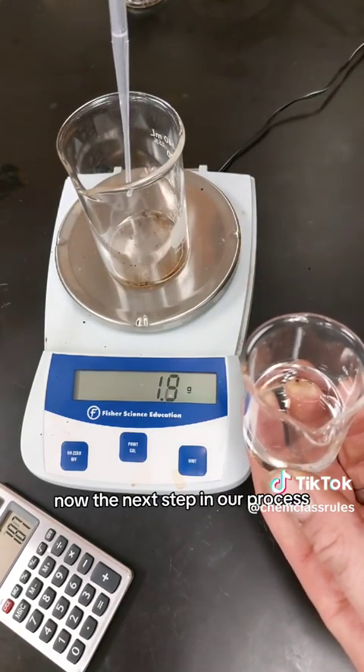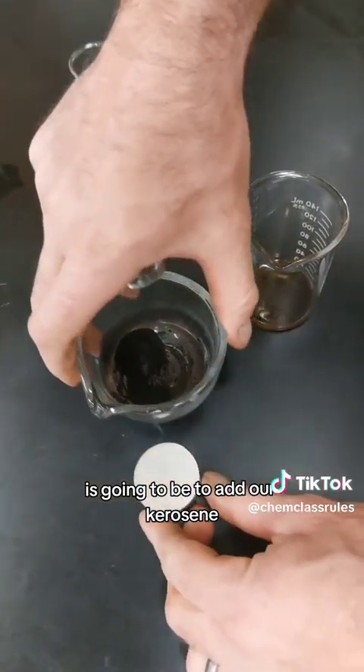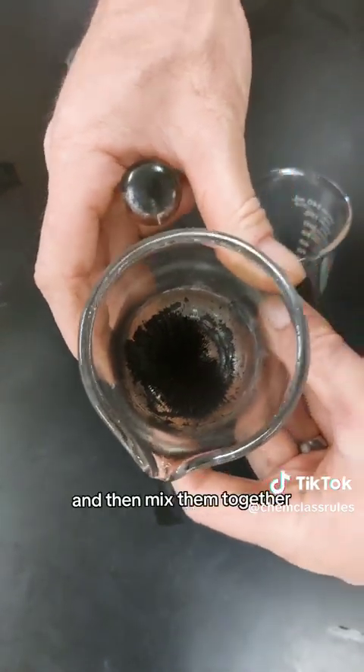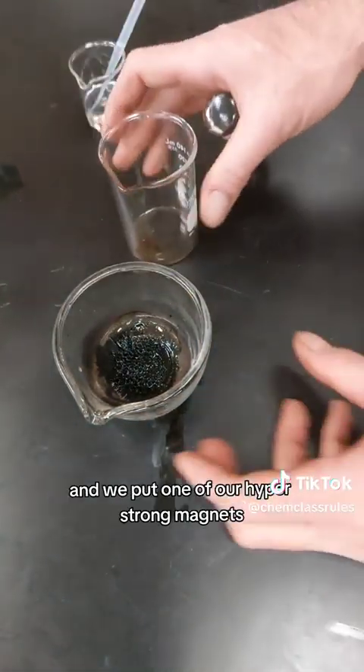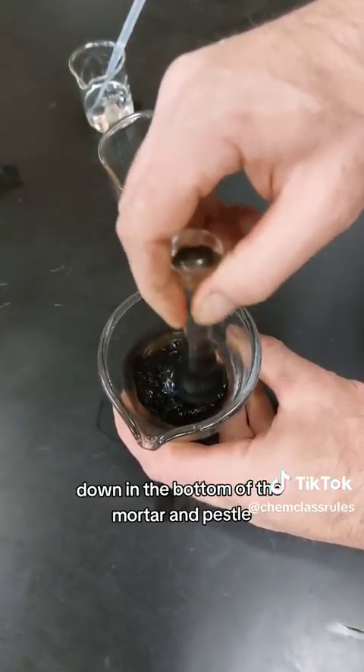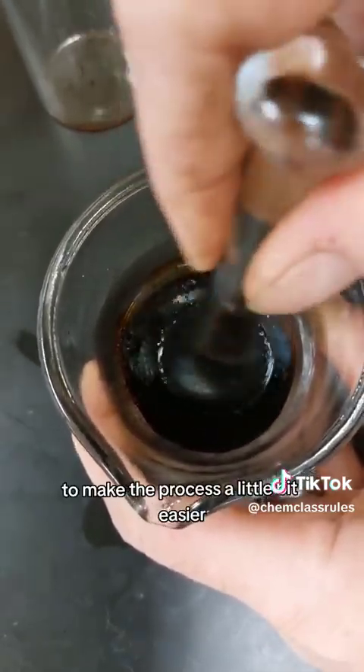The next step is to add our kerosene to our magnetic particles and then mix them together extremely well. We use a mortar and pestle for this, and we put one of our hyperstrong magnets down in the bottom of the mortar and pestle to make the process a little bit easier.